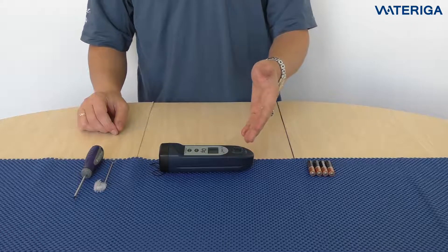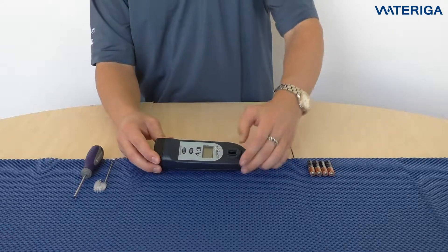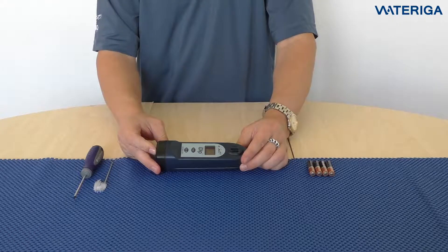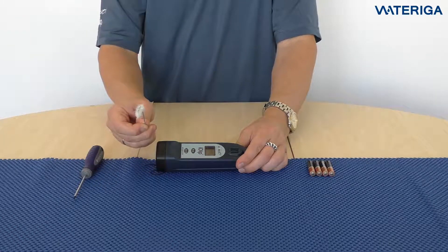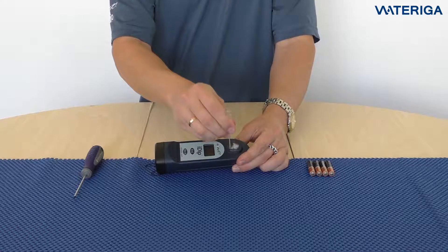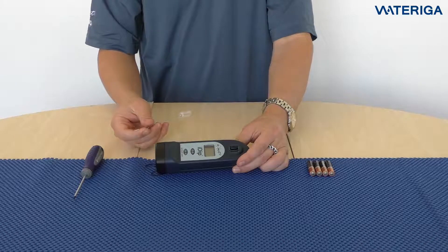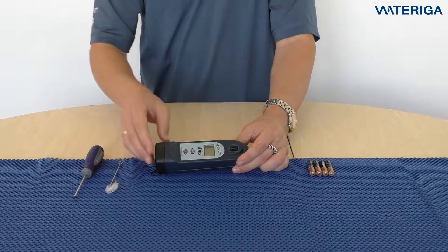The i-Dip comes with a built-in plastic cell that you never have to take out and never have to worry about losing. Use the brush to clean the cell before and after the test session, just like this. Make sure the cell is clean at all times to have the best performance.